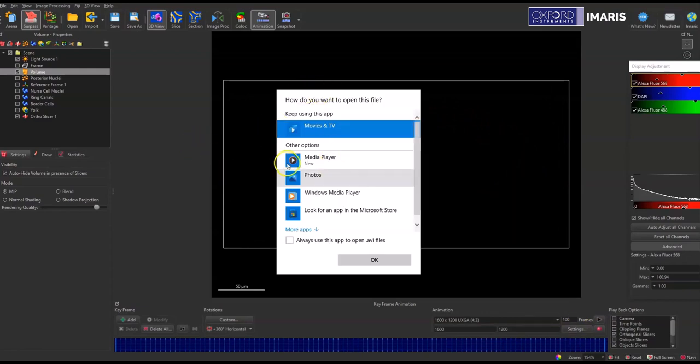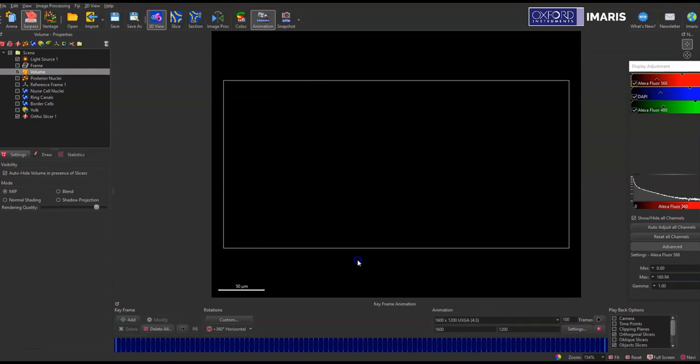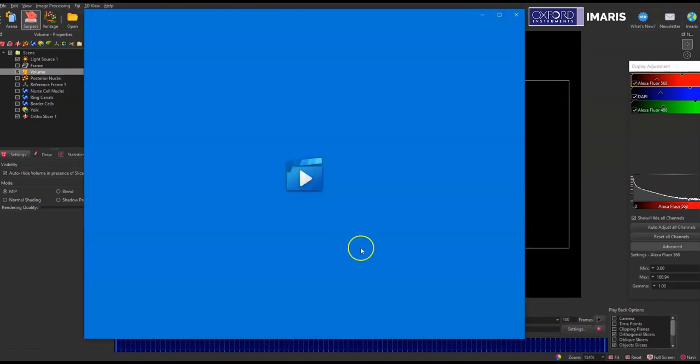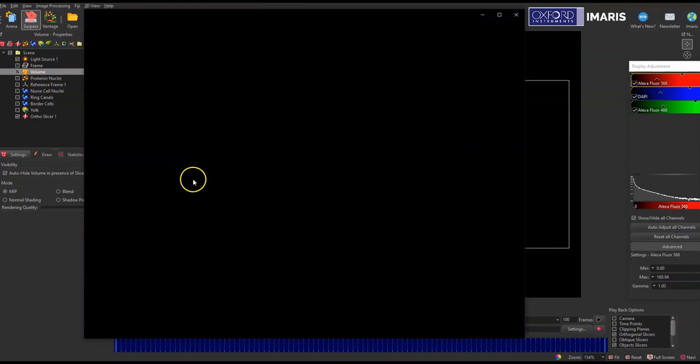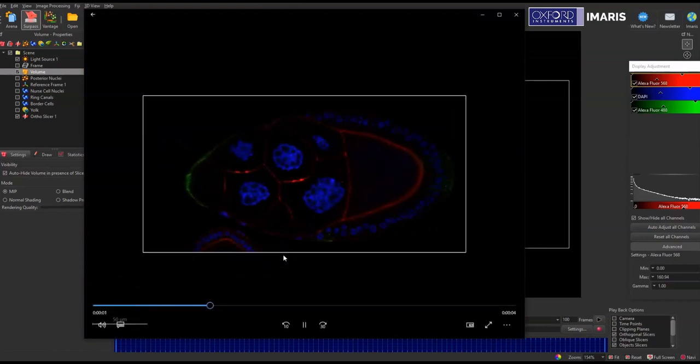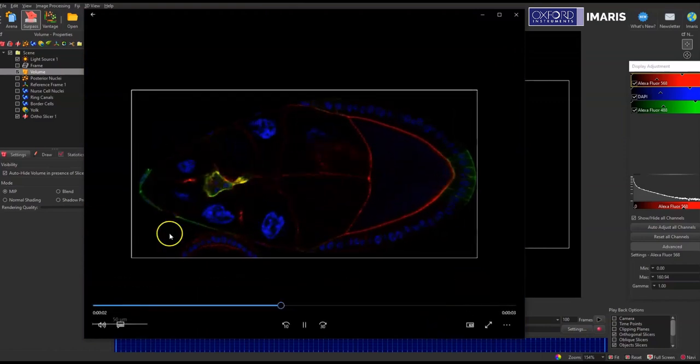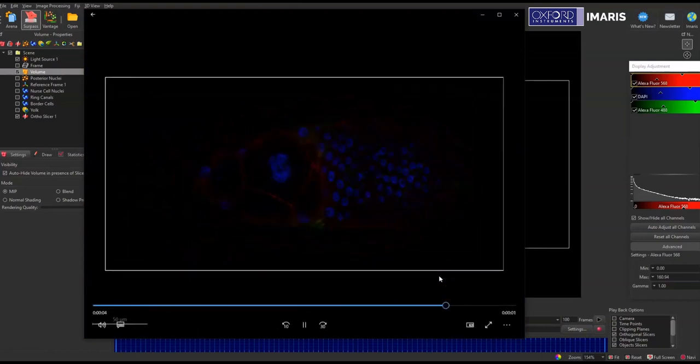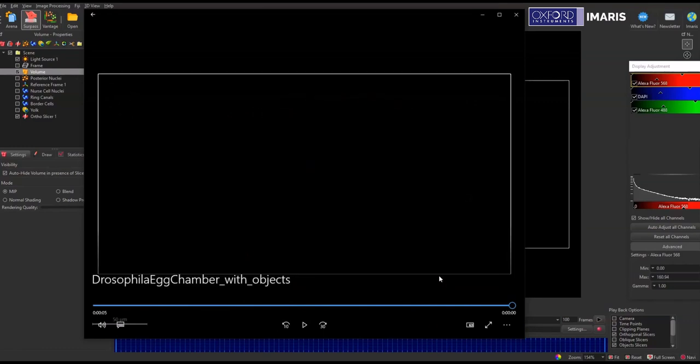And then I can watch that recording or place it into presentations, whatever I would like to do with it. And so this is what I generated just moving through the Z planes one at a time. Let me know if you have any questions. Thanks.